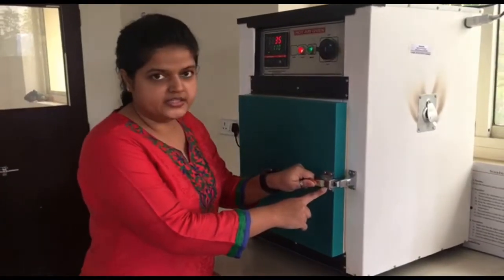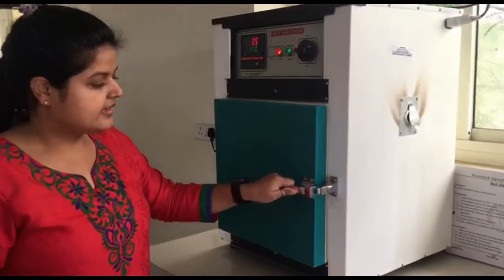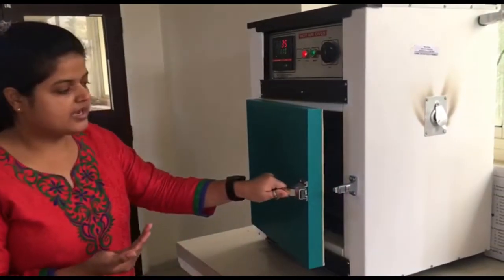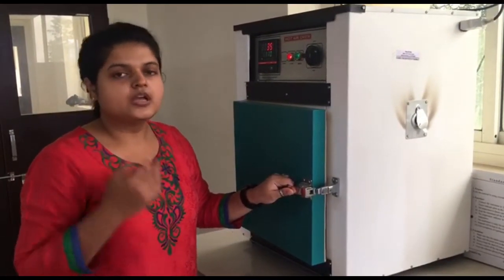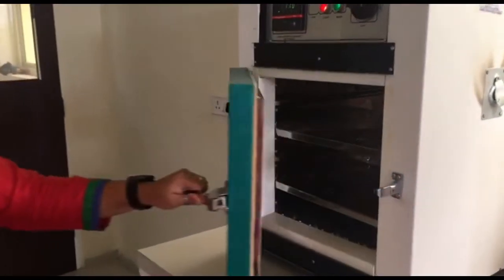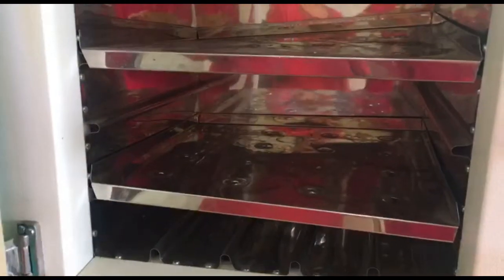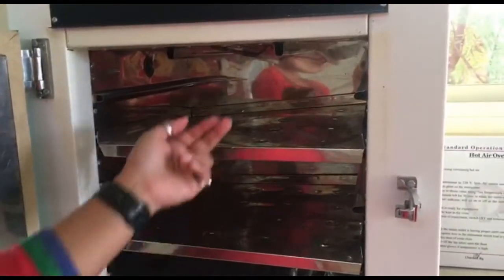Now this comes the handle. The handle is specially designed — it is a unidirectional handle. You can easily open and close it without the loss of heat. Now let us see the inside view of the instrument. When you open the instrument you will find that there are two racks or trays, and they are easily adjustable.